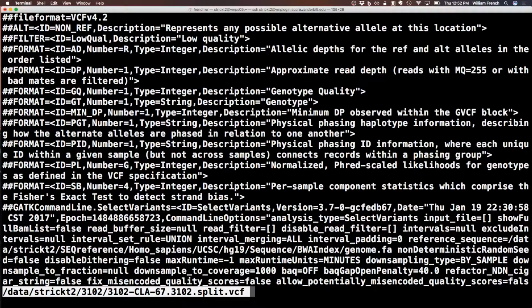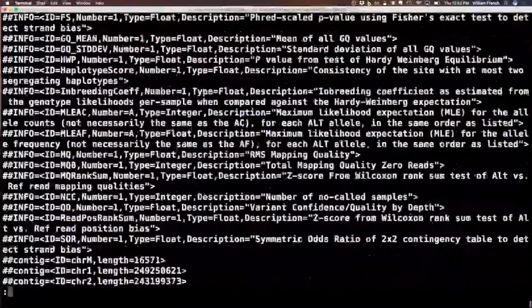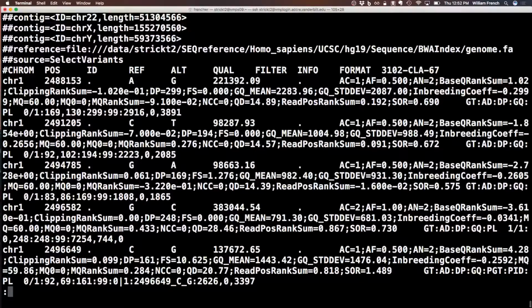So first of all, at the top end of the variant call file, there's a ton of useful information. There's going to be a bunch of definitions about what some of these abbreviations are. It's going to tell you how this file was generated, which is always really handy in case someone else is handing you a file. It's going to give you what genome you used for genotyping. And then each line is a variant. So it gives chromosome position, the reference base, the alternative base, the quality of that base, and then a whole bunch of information about that base.